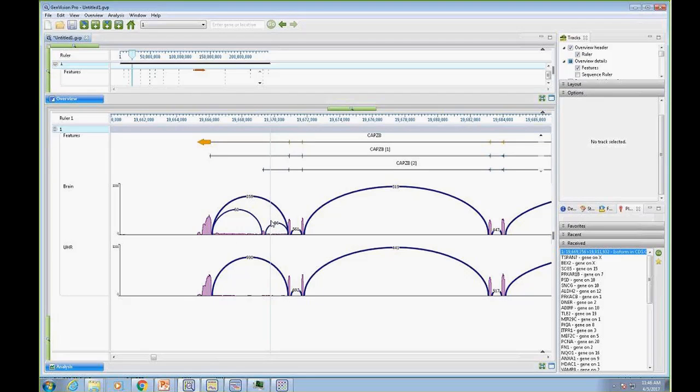So just another way, if what's interesting in your gene expression patterns is the isoform and it really doesn't impact the overall expression. As you can see, these coverage peaks are about the same. You can use that isoform table to also find differentially expressed isoforms between your experiments and get a very nice picture and visual confirmation of the isoform table.